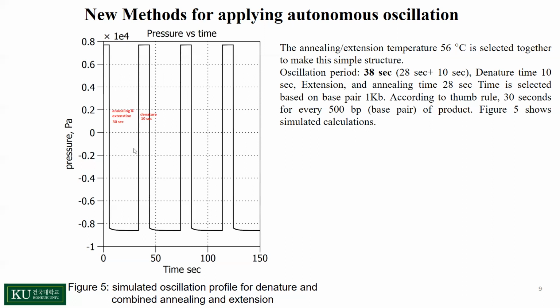An important thing here is that there are 2 different types of period, one bigger and another smaller. I can manage it by changing the oscillator's periodic resistor. That means we can change the duty cycle by changing the period of the oscillator.